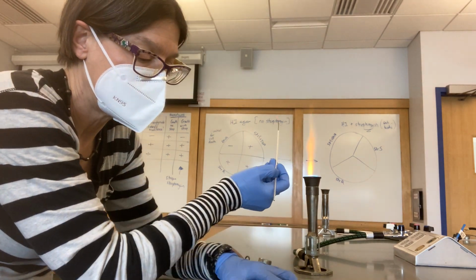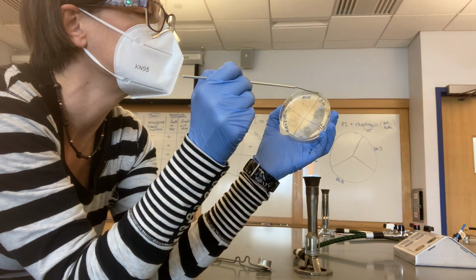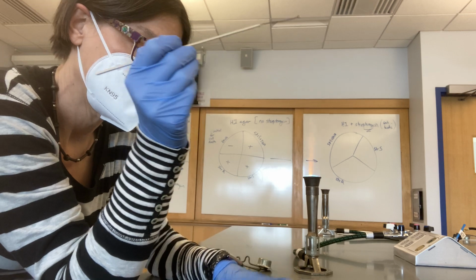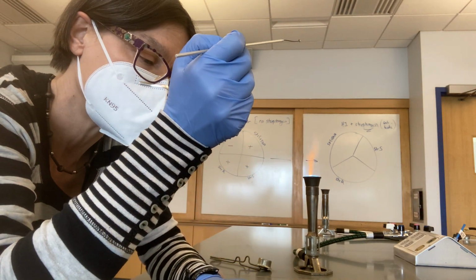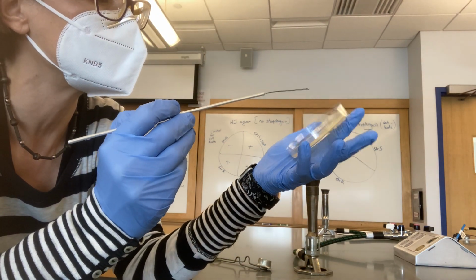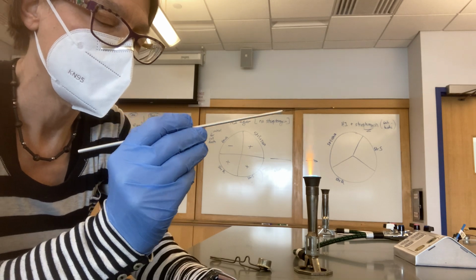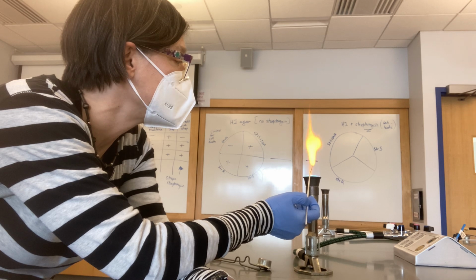And then, last but not least, I'm going to transfer the STRR cells. Scoop up. Full disclosure, I totally love plating. It's oddly relaxing. And I'm going to transfer those to the appropriate third of the plate. Lastly, I will sterilize this loop because I don't want to put away a contaminated loop.